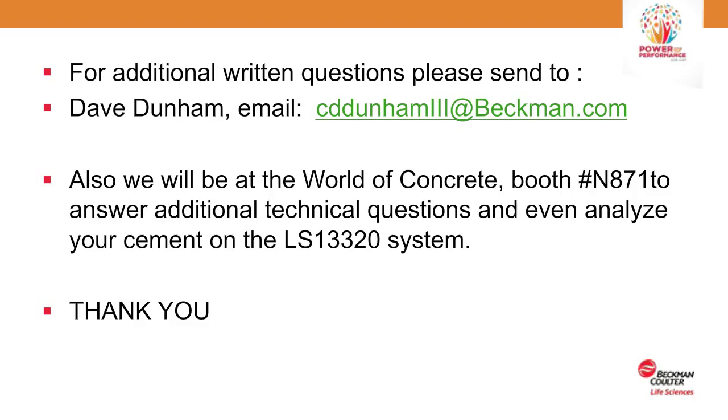And if you're going to be running just 1 or 2 shifts, that could be a little bit longer. I usually don't hear about lasers being replaced until maybe 12 years out, 14 years out. So that's great. They last a long time.